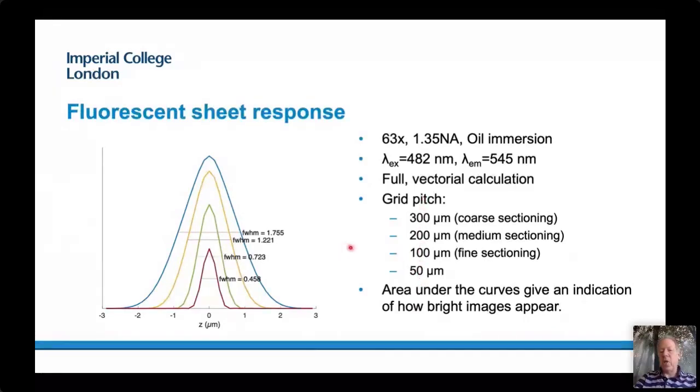It's actually to be able to cope with a wide range of different microscope objectives, because different objectives will have a different relationship between magnification and numerical aperture. But we're clearly sectioning. We get a strong pixel in focus for all of these, which then reduces as we go out of focus. As we go to a coarser grid, we do get more light through, and this is one reason you might want to change the grid pattern. It gives you more signal.